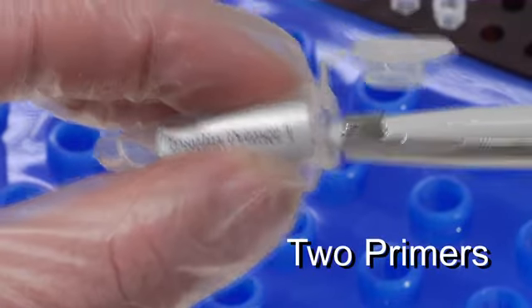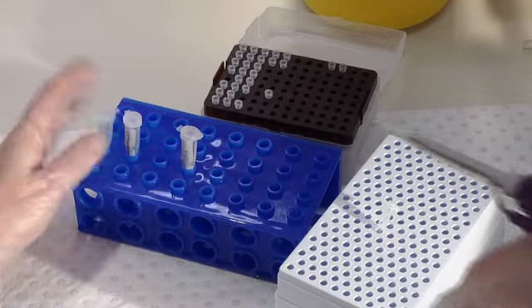We then take a sample of each of the two primers that are designed to only anneal to either side of our insulin gene.